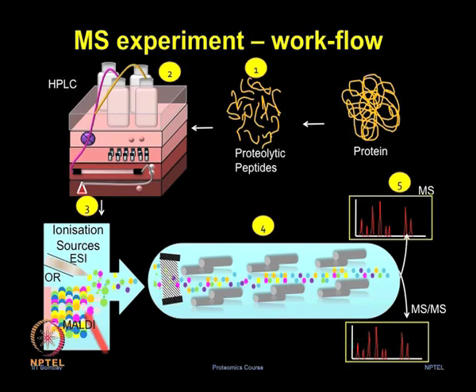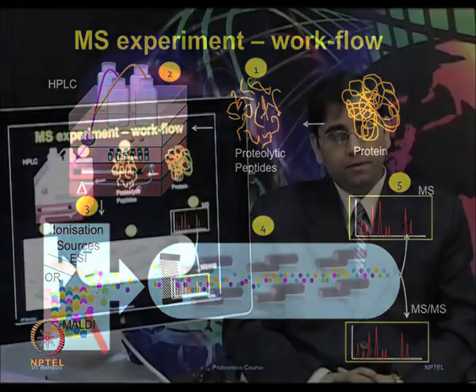Specific ions are randomly selected in the collision cell and then, based on collision induced dissociation, the resulting fragment ions are further measured in the second mass analyzer. The MS precursor ion intensity can be used for peptide quantification and MS ion fragmentation can be used for sequence information and protein identification.